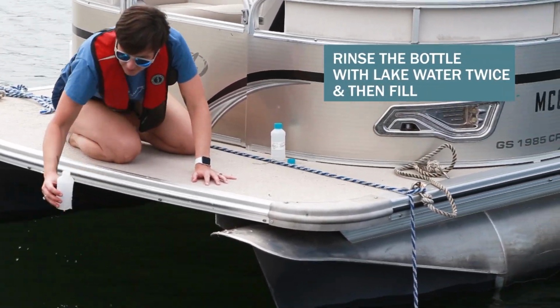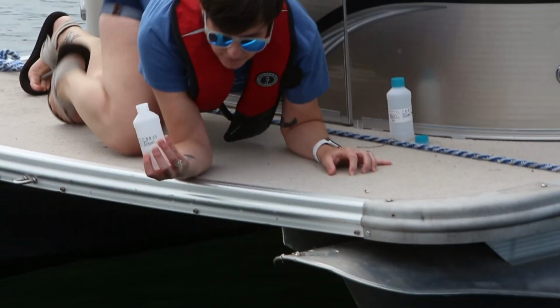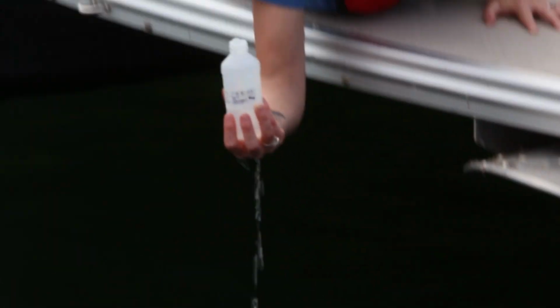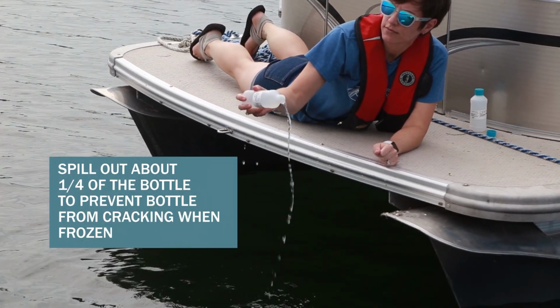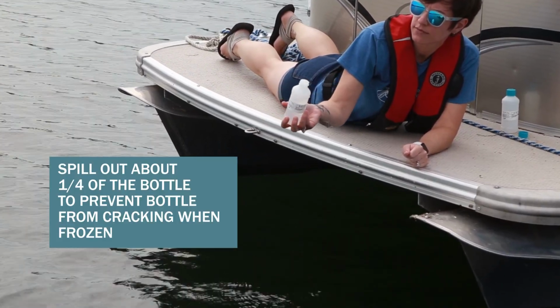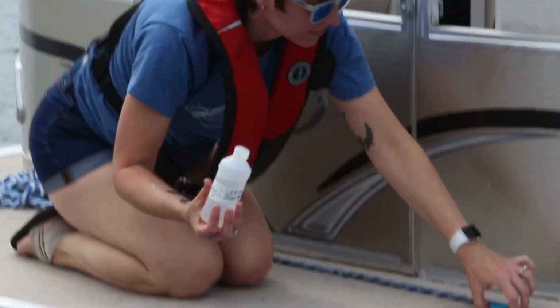Now grab the bottle around the base. Turn the bottle upside down and lower it into the lake about 1 foot below the surface. Tip the bottle upward to fill the bottle. Bring the bottle back up to the surface and spill out a small amount of the water so that the bottle is only 3/4 full. This will ensure the bottle will not crack when you freeze the sample.